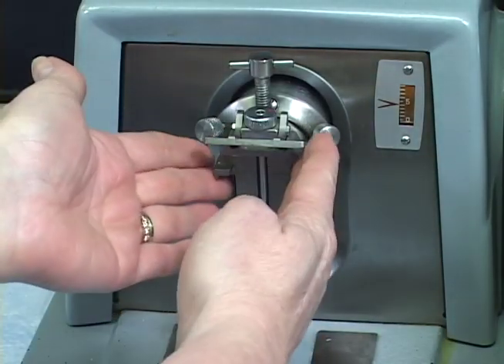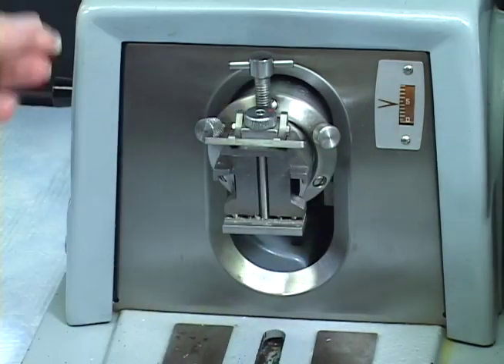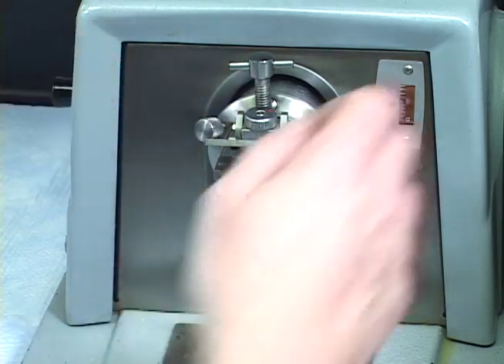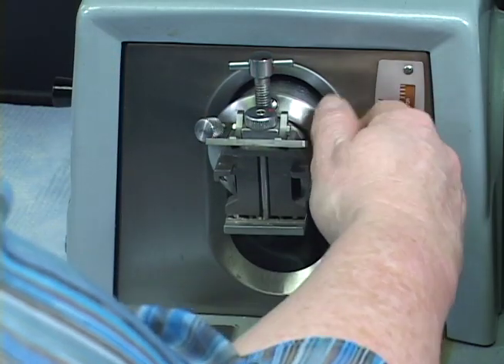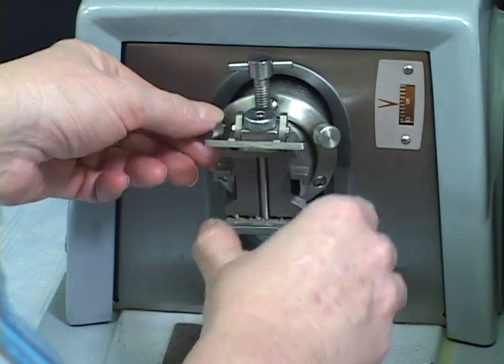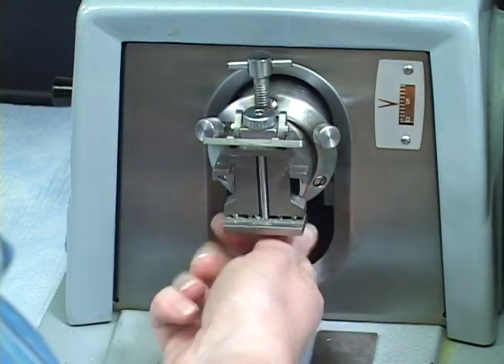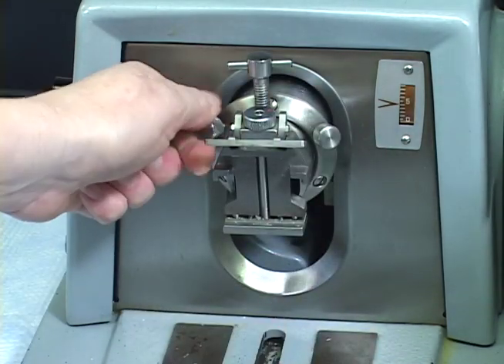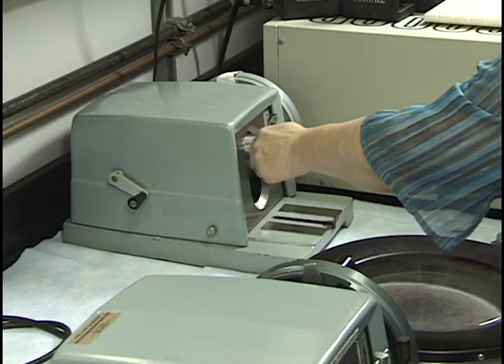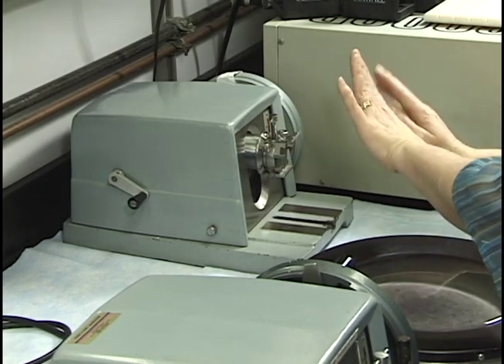Whereas if I want to move, let's say I want to move this whole chuck holder and tilt the block to the left. In order to do that, I have to loosen this one and tighten. Well, that actually moved it to the right. So I'd have to loosen this one and tighten this one. If I want to move it, let me kind of show you that. So I loosen this one, tighten this one. That's if I'm wanting to tilt the block.